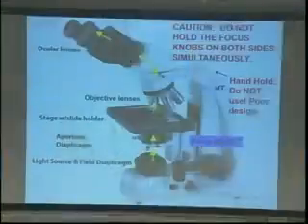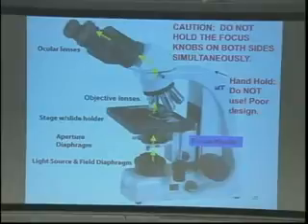The other design flaw is the 40x objective. That lens is recessed a lot in the holder. So a lot of dirt, dye, things like that get in there. It's really hard to clean. If you have a great image at the 20x objective and you rotate the 40x objective in and you can never get in focus, you need to clean it very thoroughly, okay? Now that having been said, you may still not get it clean. Tell the GSI, I can tell you how my staff do it. Sometimes we actually have to take these lenses out of here and clean them in a different position so we can get better access to them, okay? Bad design flaw, but anyway, that's how it works.